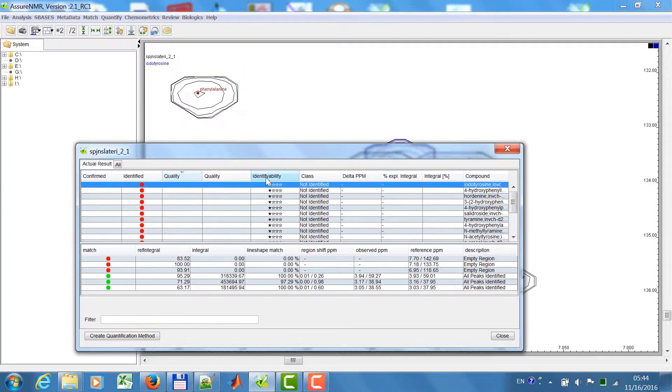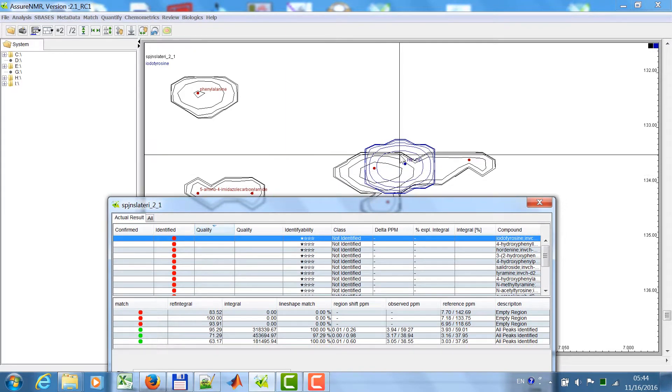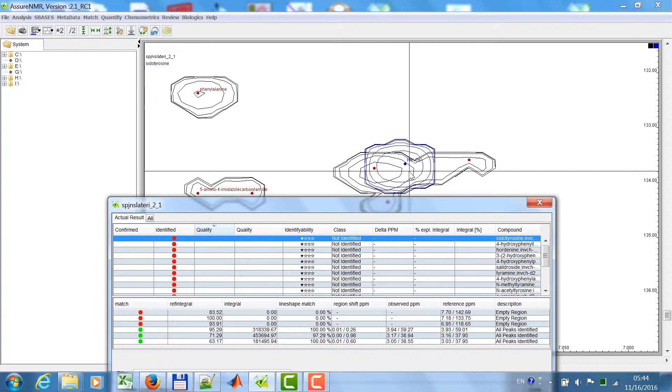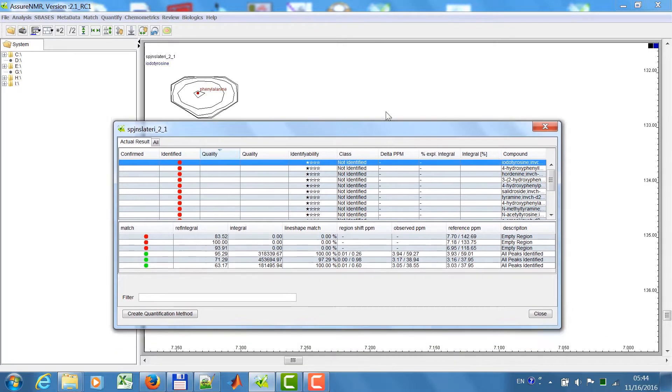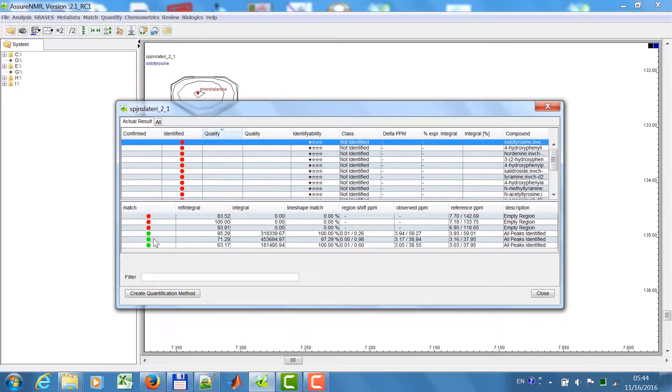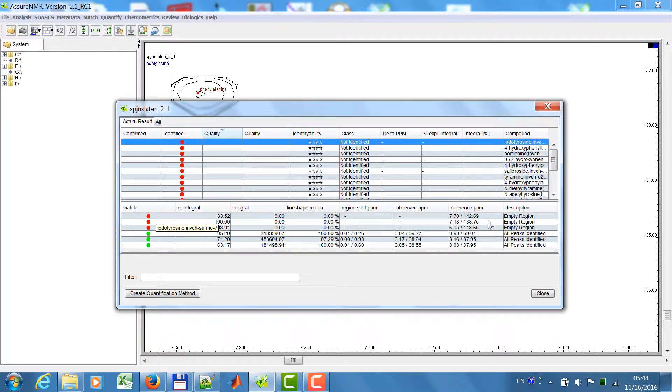In this case, you see this was not matched. Then you can have a look and see why it was not matched. You see here it has some intensity, but from the six areas, three are empty regions, so this was one region where it was not identified.